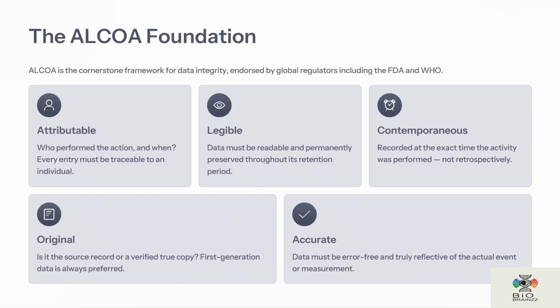The foundation of data integrity is built upon the ALCOA principles. These principles are recognized globally and form the basis of regulatory expectations. When laboratories follow these five principles, they establish a strong foundation for trustworthy scientific data.